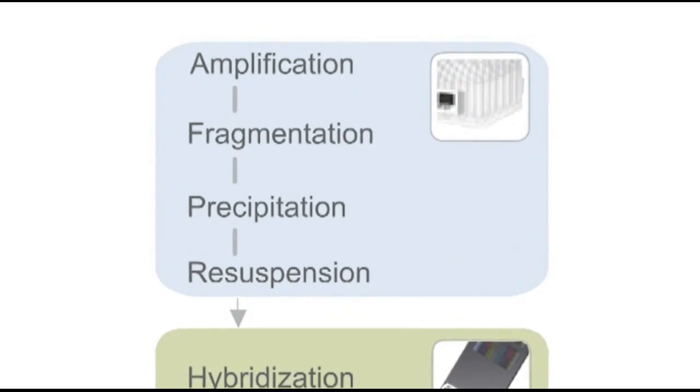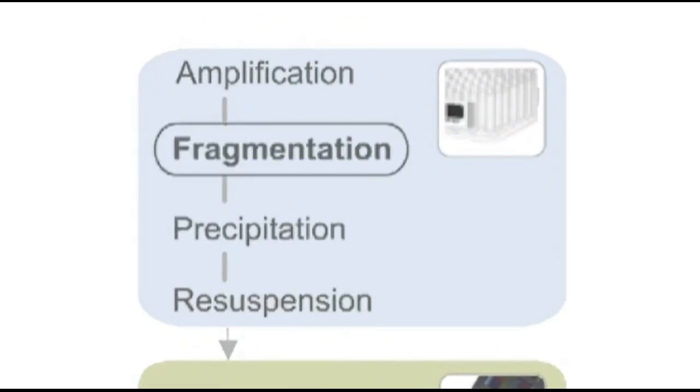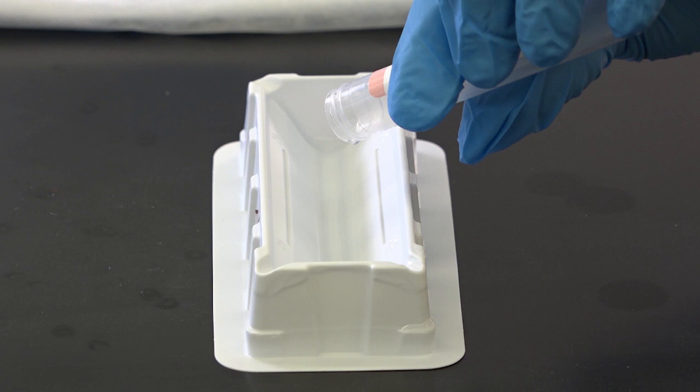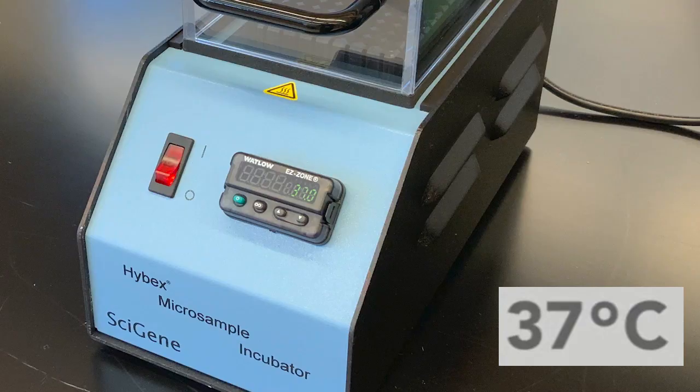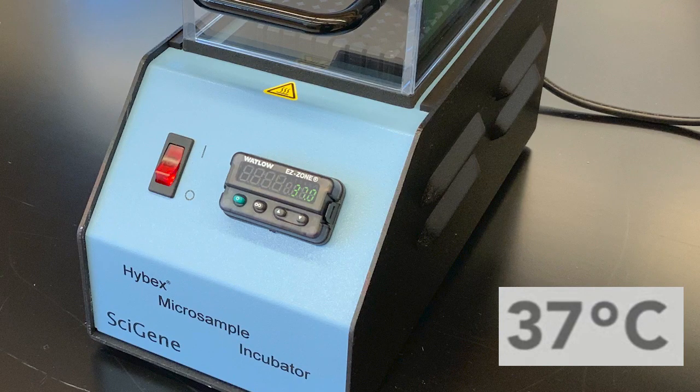The next step in the Infinium assay is fragmentation. Remove the fragmentation reagent from the freezer, allow to thaw, and pour into a disposable trough. Set the heat block to 37 degrees Celsius.